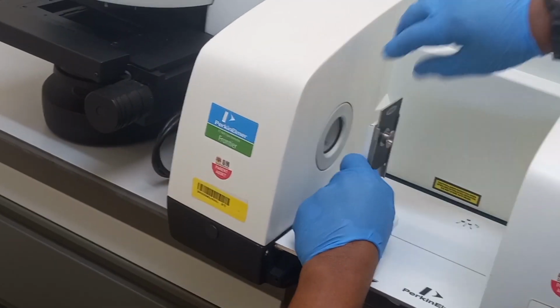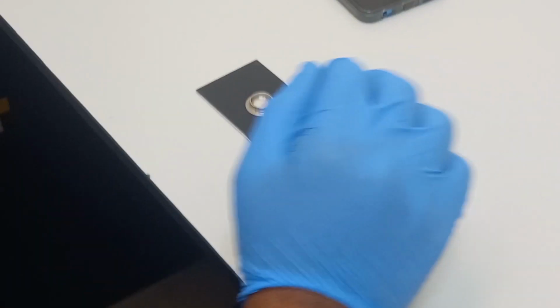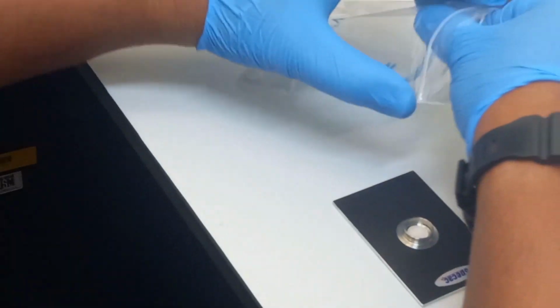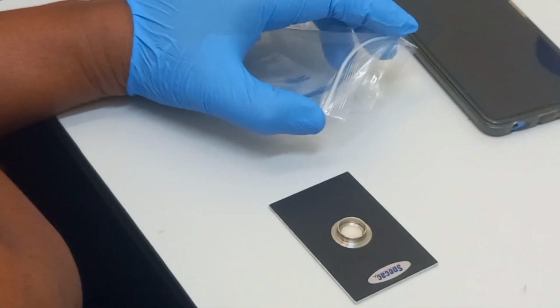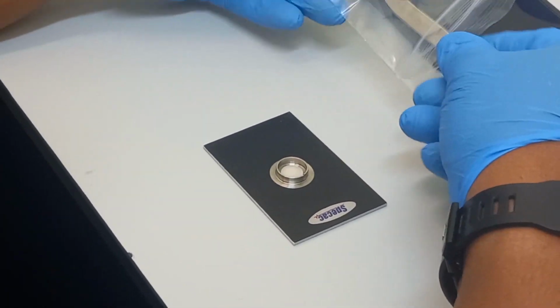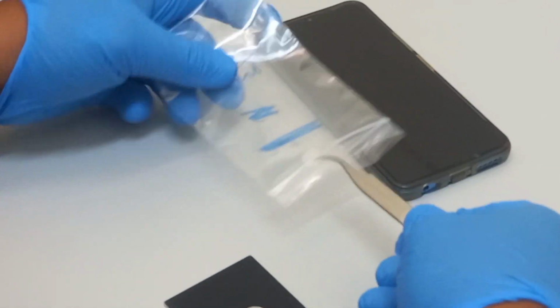Based on this, you can analyze the processed spectrum to identify the characteristic absorption bands and functional groups present in the sample. For this, we can compare the spectrum to reference spectra or databases to aid in the identification. Quantitative analysis can be performed by comparing peak intensities or using calibration curves if available.